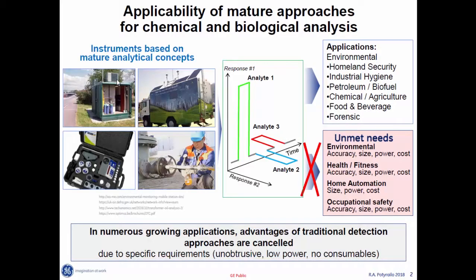So for a variety of applications, there are quite a lot of different types of analytical tools, analytical instruments that are used in the field, in the lab. And the reason that they're so big, and sometimes you do the measurements by taking the samples first and then having the kits, is because the samples that are being analyzed are not simple, okay? They're very complicated, and therefore the conventional sensors don't help to do those measurements at all, okay? And that's why you can see that for demanding applications, you have a shack where you put your analytical instruments.